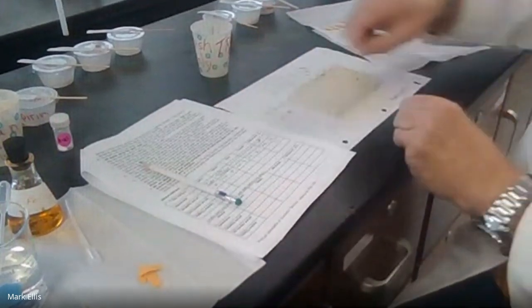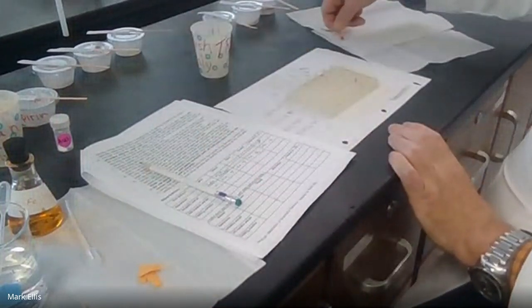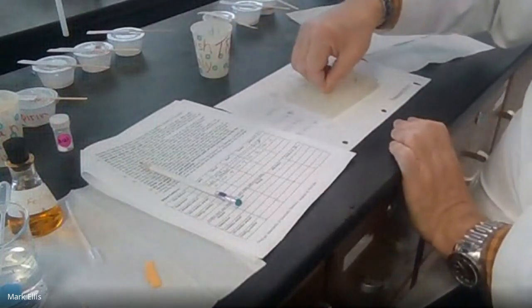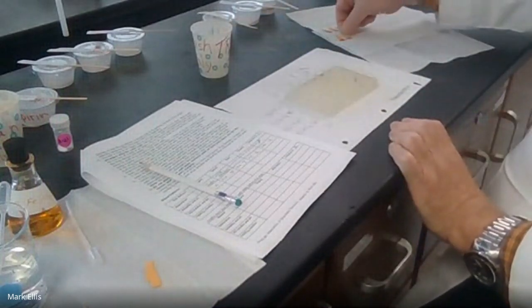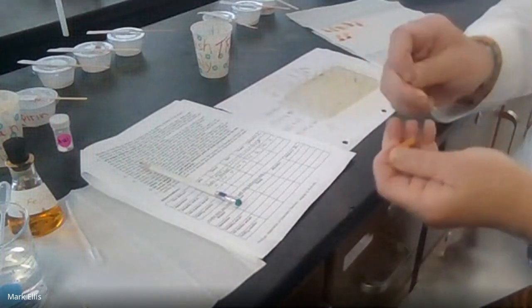Okay, so I'm going to dip. Boop. Definitely acidic. That's definitely a 1. Nice dark red. Second one, same thing. Lab partner to be getting these ready for me.